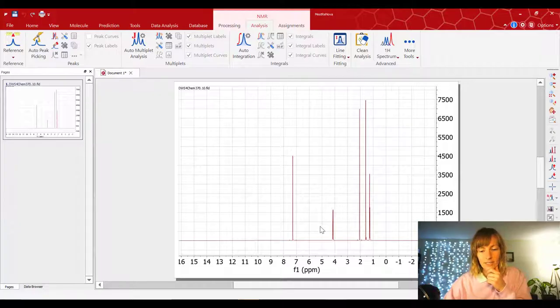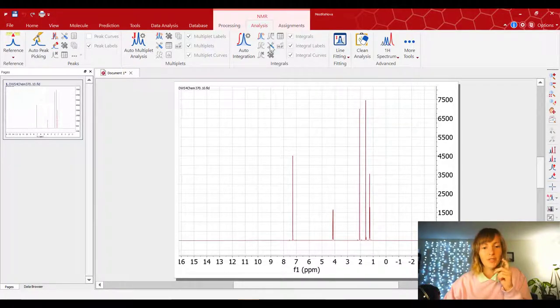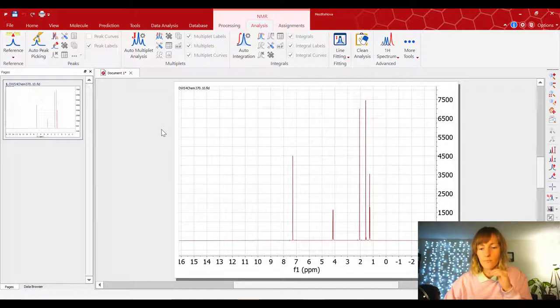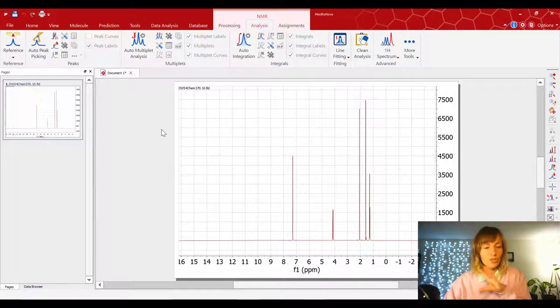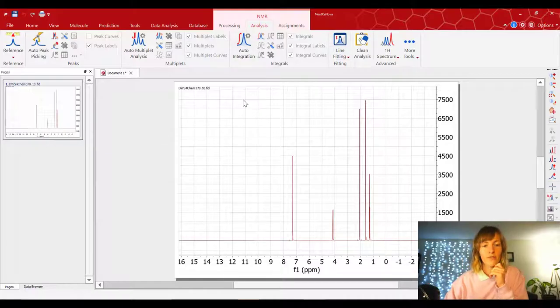Aha, here it is. And this is a very nice spectrum, but there are a couple of things that we need to do first before we start zooming in and picking the peaks and integrating and all that good stuff.